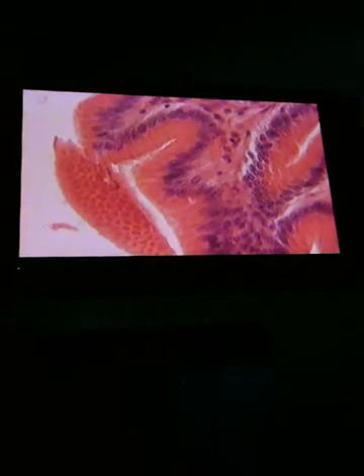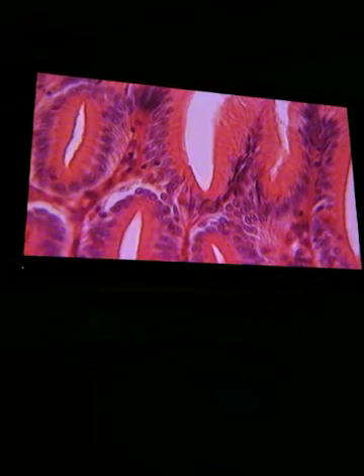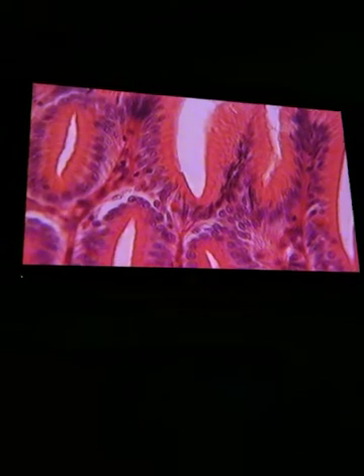How do we identify a gastric pit? I'll show you. They're actually pretty easy. Depending on how much he has it magnified, try to find a good view. If you're looking at something like this, the gastric pits are always down here, like here, here, here. They literally are a pit right down at the very bottom. And this is where you'd find your parietal cells and your chief cells that are going to secrete hydrochloric acid and pepsin and so on. All the ones at the base of those open areas are called the gastric pits.